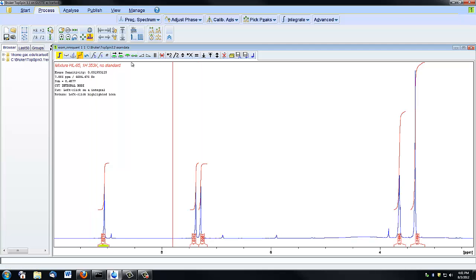So if I move on to the next integral, I can do the same process again. Just evening that out.